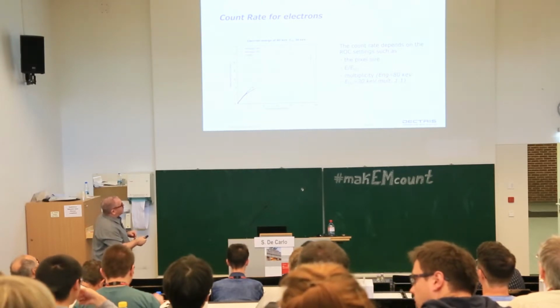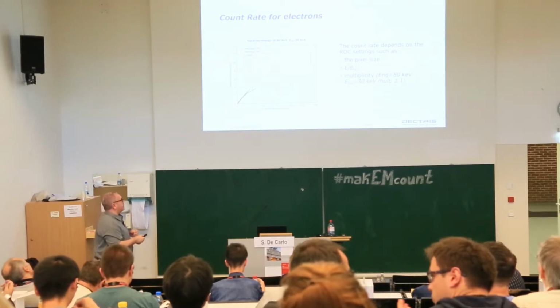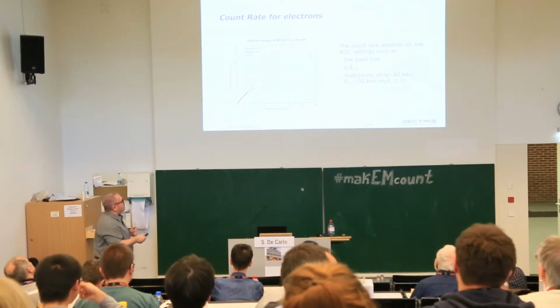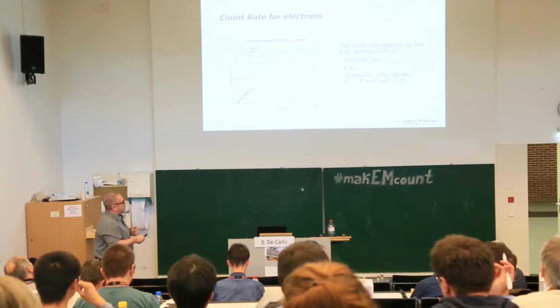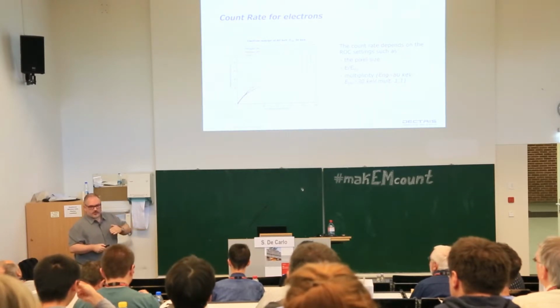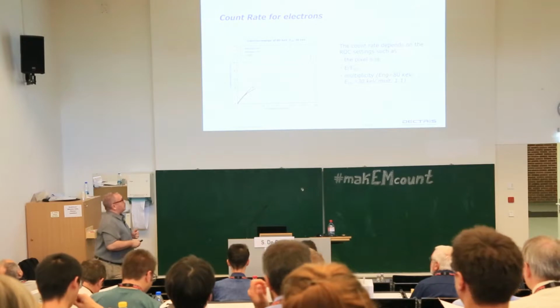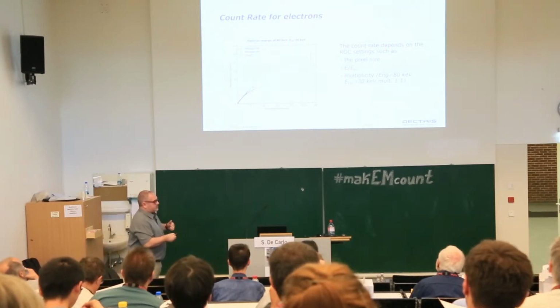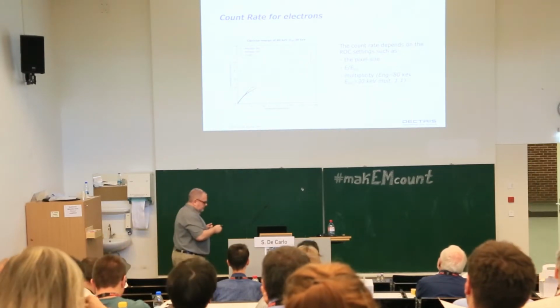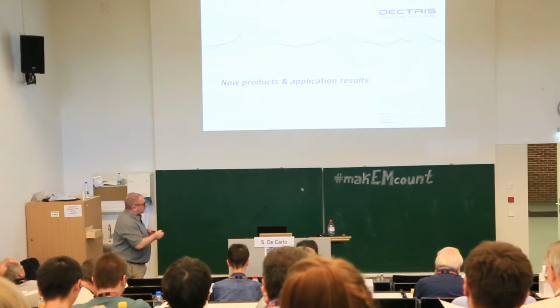Of course, this depends on a few factors. So this is the readout chip settings, the bias, the pixel size, and of course the total surface will influence this count rate. This is the ratio between the impinging energy of your photon or electron with respect to the threshold, and also what we call the multiplicity, that you may have at a certain energy and at a certain threshold more than just one count per electron. So as you go to very high count rates, this relationship is no longer equal to 1, but you may have, for this particular energy, 1.1 counts per electron, at 200 keV maybe 2.2 counts per electron, and so forth. How does that translate into application for electron microscopy?